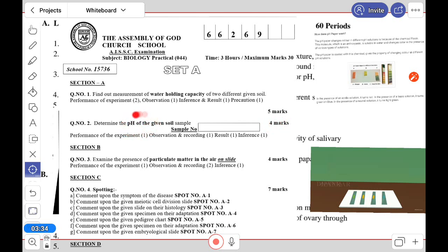pH is a very easy experiment and it will not take much time, 2 to 5 minutes hardly. Every year this type of question is given normally. This is one less time-consuming question. Now, let's see how we can do this.